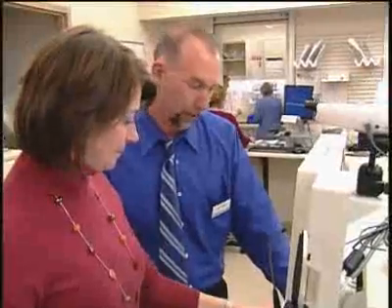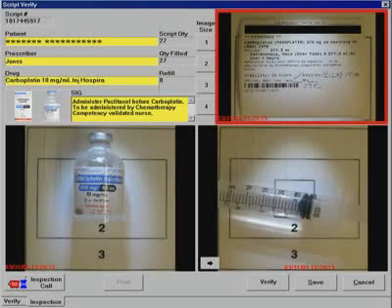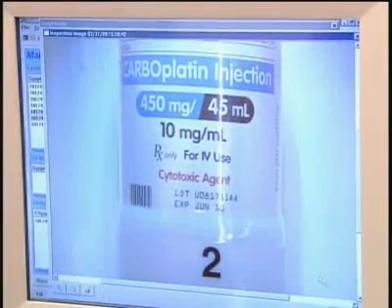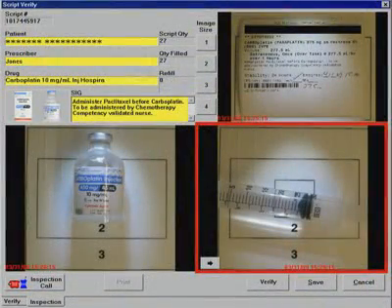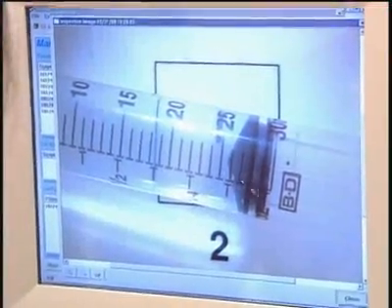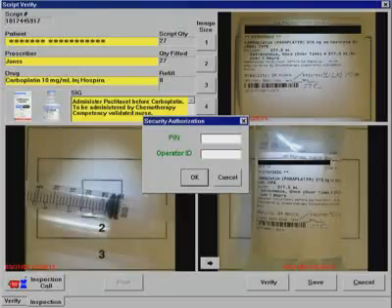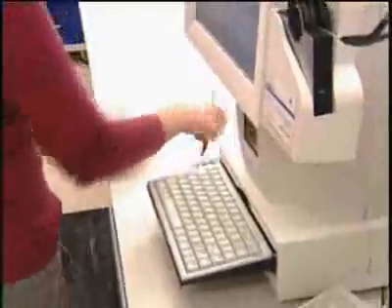It looks like we have some prescriptions that you need to verify. Yes — can you just kind of walk us through your process? Sure. This one says on the screen that it is filled and ready to go, so I can click on it. I have actually already brought it down here, so I'm going to double click and pull it up. I've got this patient — it has their name, their drug. It tells me they are getting 275 milligrams of carboplatin. Here is the picture of the vial, and I'm going to blow this picture up because the expiration is on the front — it expires June of 2010. And here is the syringe: it is 10 milligrams per mil, so I should have 27.5 mils, and that is what I have. And then I have the completed product here so I am just going to verify. Every time you do that, it assigns your initials to that action, so later on you can go back and see who did the fill and the verify. Correct. This is ready to go to the nurse and be administered to the patient.